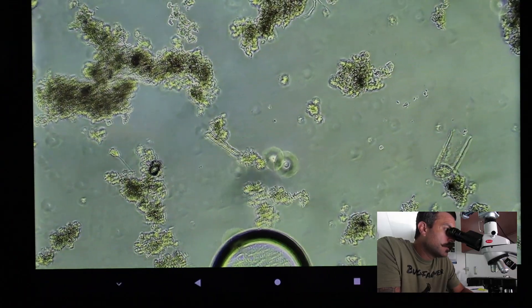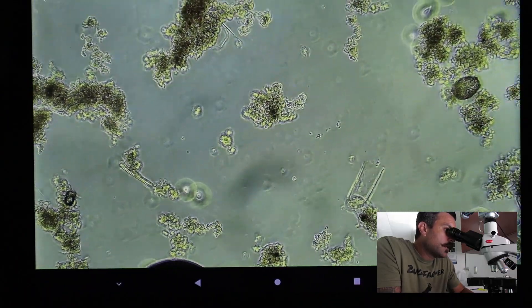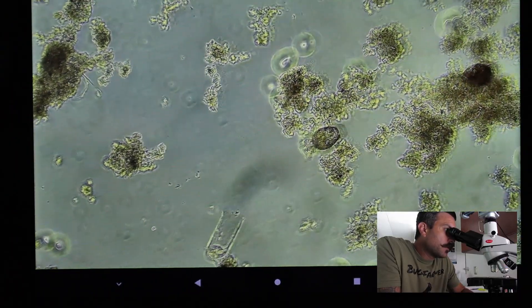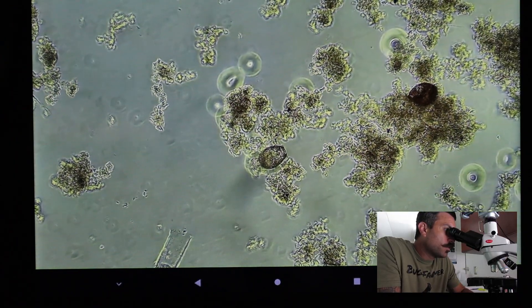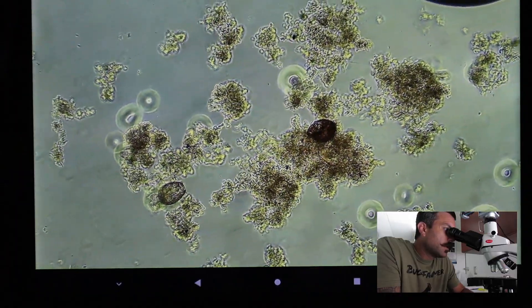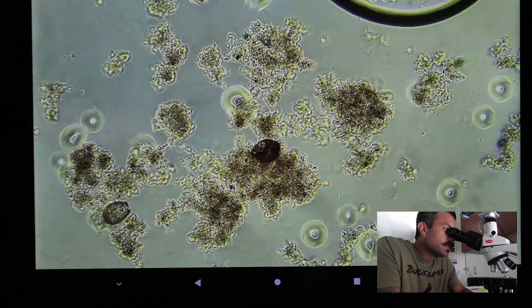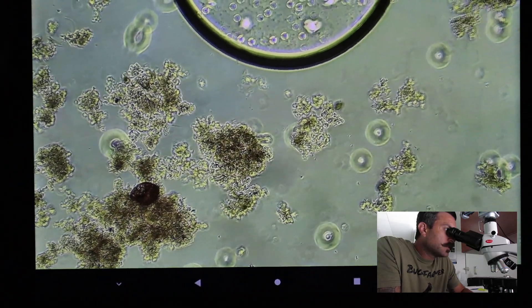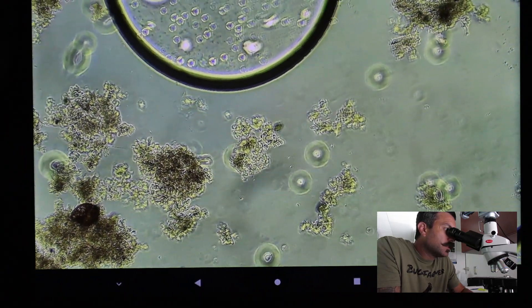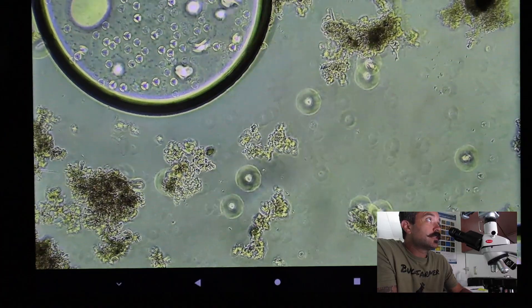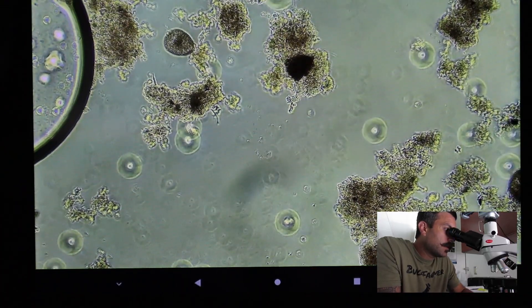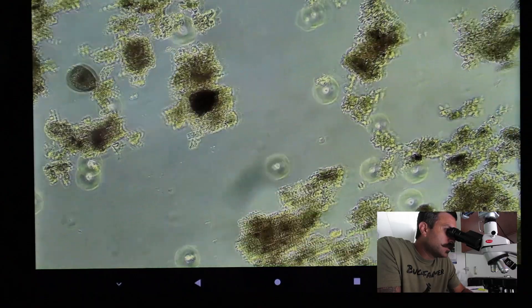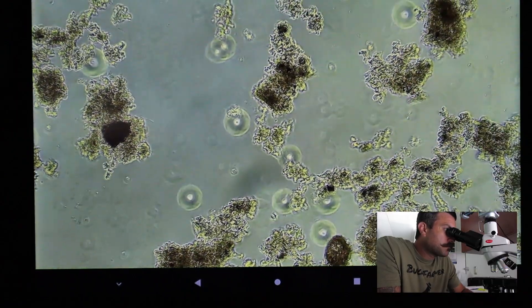We're also studying our floc here as we scroll. As operators looking under the microscope, we can see how it's performing and how it's clumping together. Some of this looks pretty small, but it's still a light color - not bad. That large circle is just a big air bubble from not getting the slide quite right.